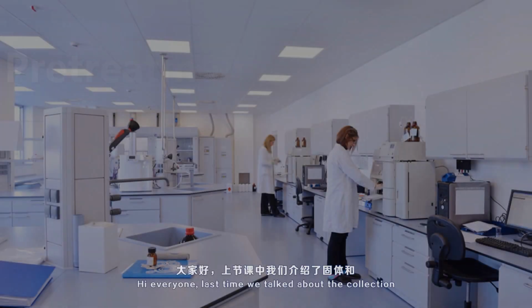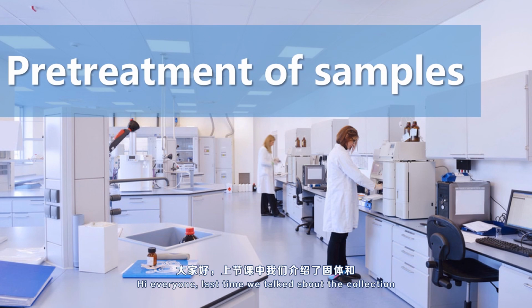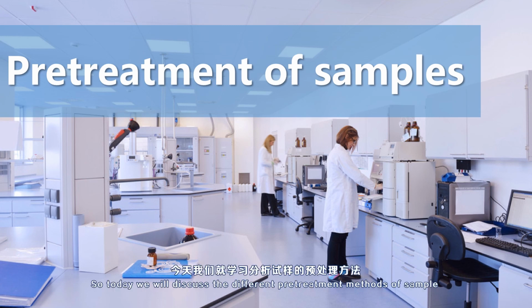Hello everyone. Last time we talked about the collection and preparation of solid and liquid samples. Before initiation of quantitative analysis, we still need to perform sample pretreatment. Today we will discuss the different pretreatment methods of sample.